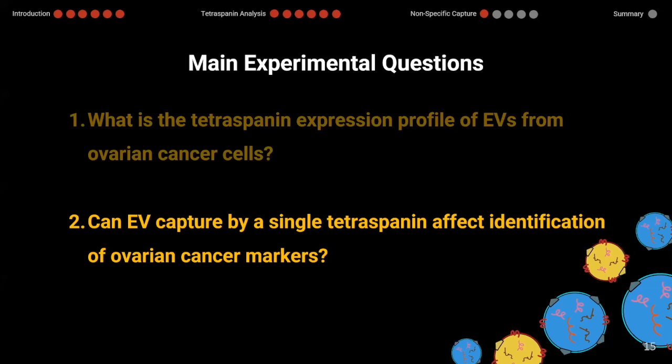But we instead decided to use biotinylation of our EV population using this molecule. This molecule should non-specifically bind to free amines on protein surfaces. Since all EVs should have some form of protein on their surface, this should be a great way to non-specifically label the entire EV population.